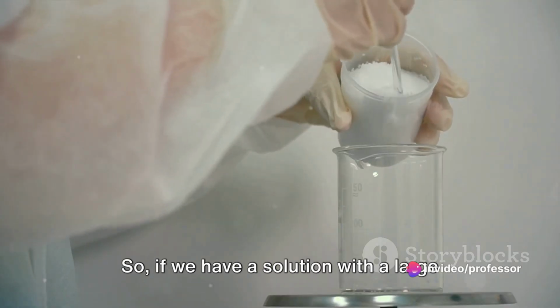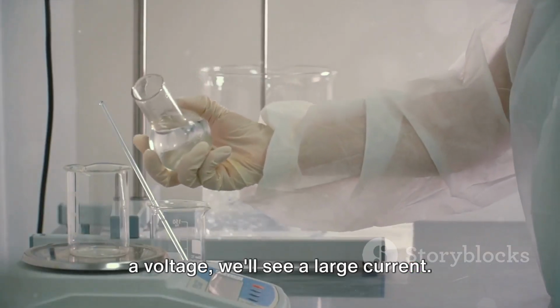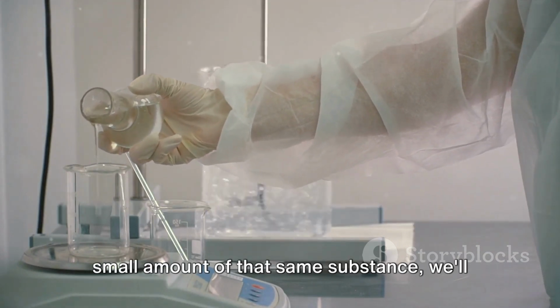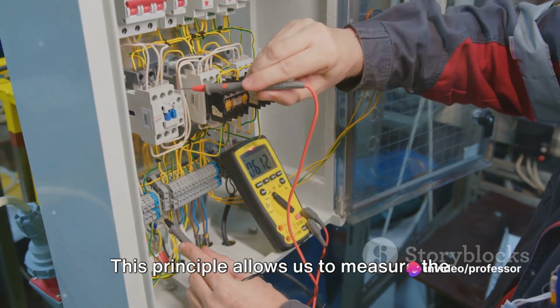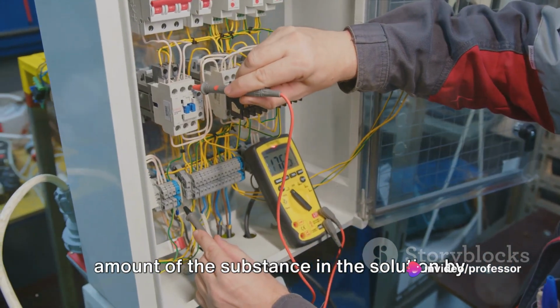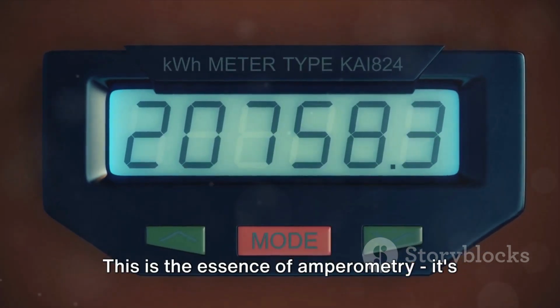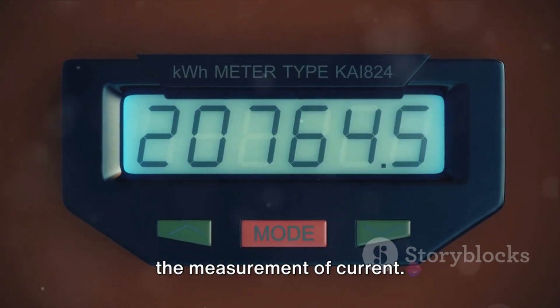So, if we have a solution with a large amount of a certain substance and we apply a voltage, we'll see a large current. Conversely, if we have a solution with a small amount of that same substance, we'll see a smaller current. This principle allows us to measure the amount of the substance in the solution by simply measuring the current passing through it. This is the essence of amperometry. It's a method of quantitative analysis based on the measurement of current.